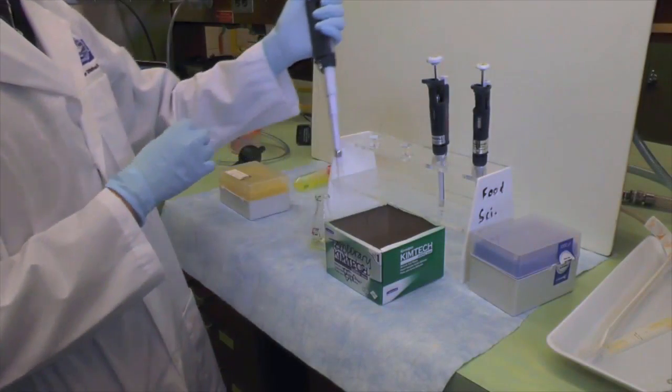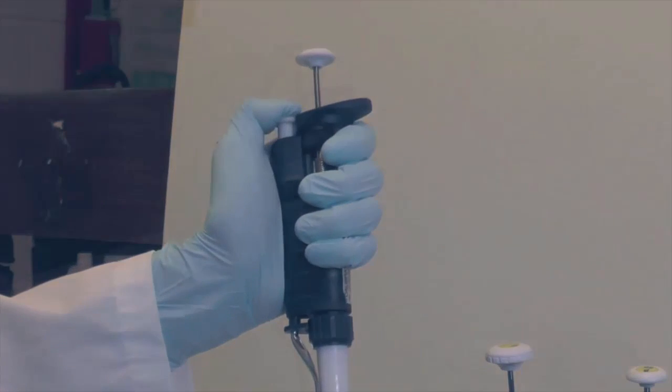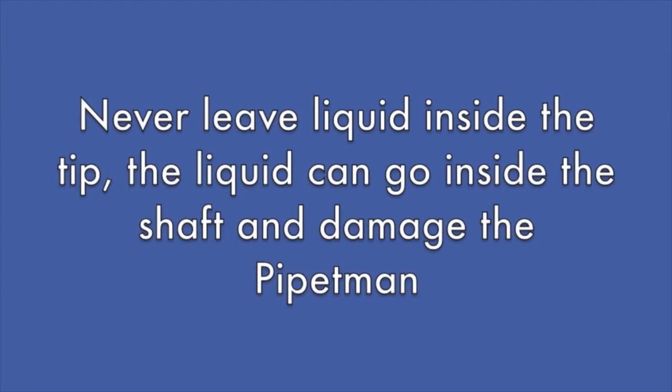If you need to change a pipet tip, you can eject the tip by pressing the tip ejector button. You should never leave a pipetment with liquid in the tip on the bench. The liquid will be released into the shaft and affect the function of the pipetment. Always eject the pipet tip before putting it down.